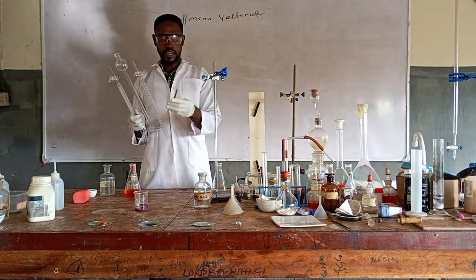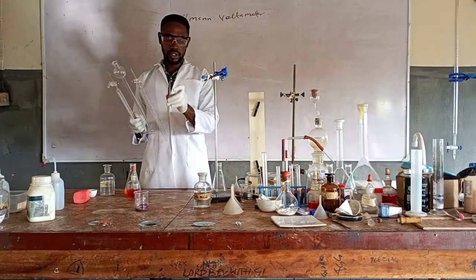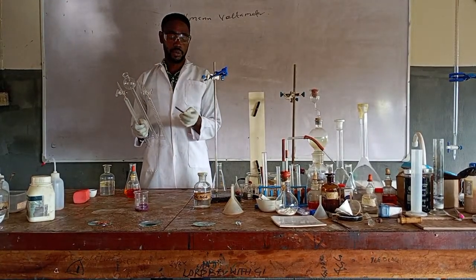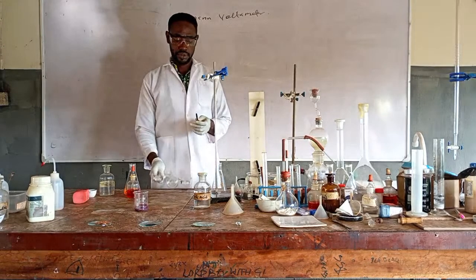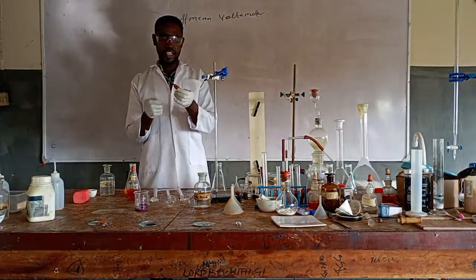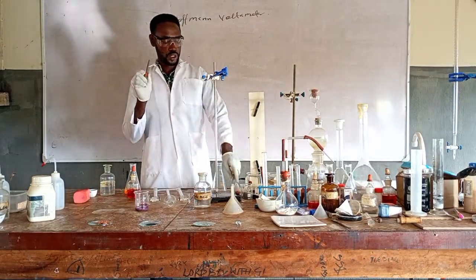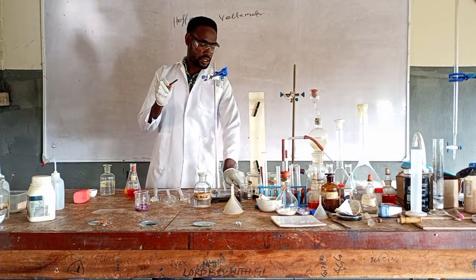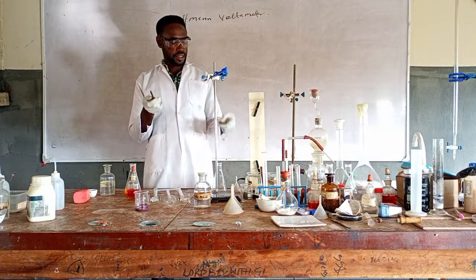So over here is the electrode, and we learned carbon and its compounds. What are the allotropes of carbon? The crystalline allotropes. If this happens to be a crystalline allotrope of carbon, which one do you think it is? Diamond wouldn't be.